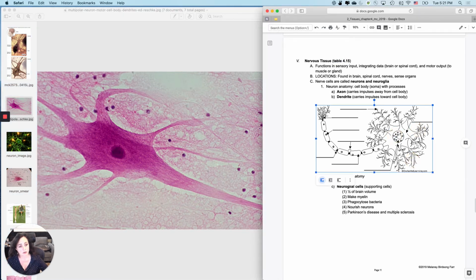And you've got your nucleus and your nucleolus. All of these are dendrites. This is the axon, and the axon has this fatty covering called myelin, which insulates and speeds transmission. So in this cell right here, the information is going in this side and out that side. The myelination speeds up transmission in the axon really, really dramatically. And then you have these branches at the end as well, which we'll talk about in another set of notes.